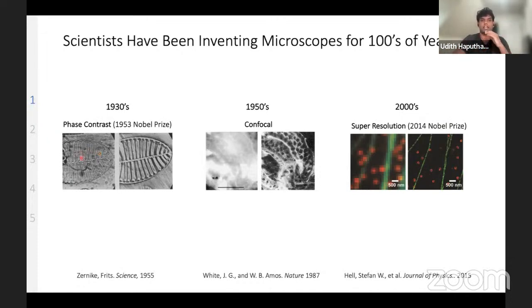For example, if we don't have phase contrast and just image the amplitude of the field, we get this one. With phase contrast, we get higher contrast of the phase, which has more details if the sample is thin and transparent.